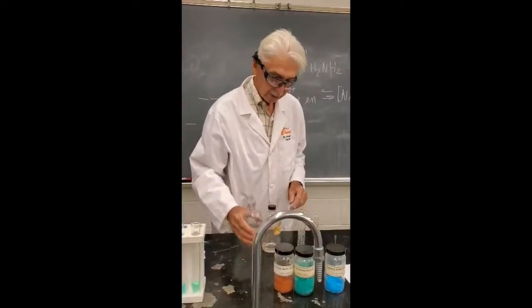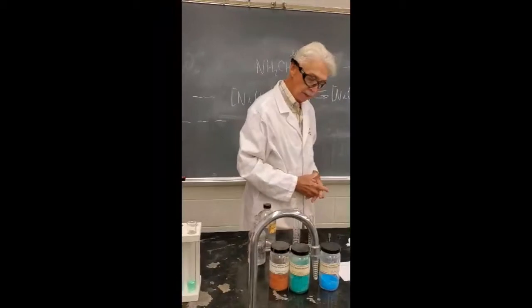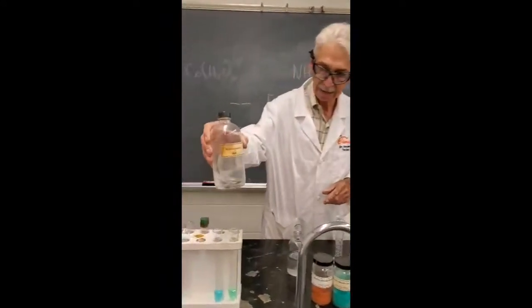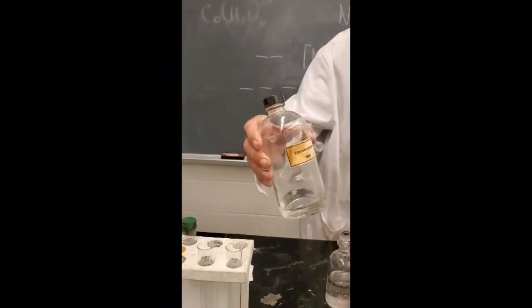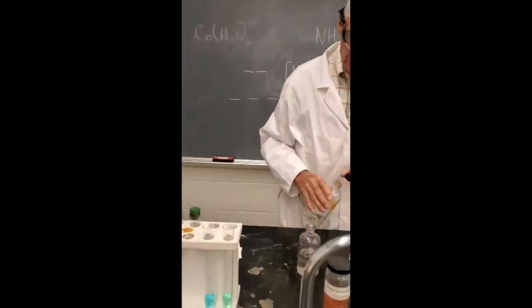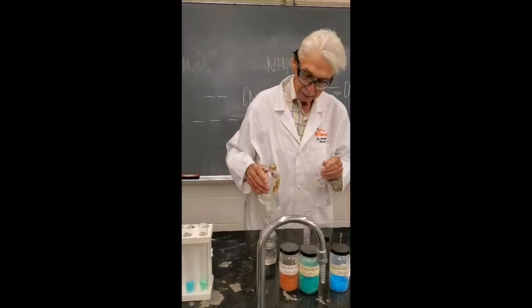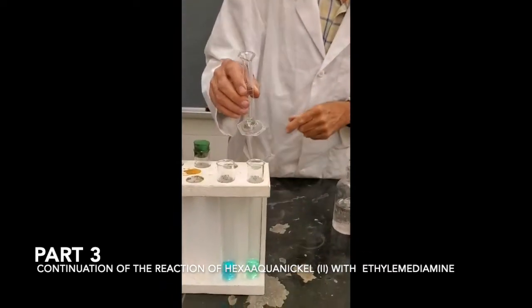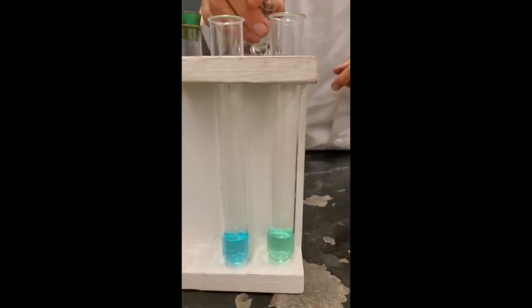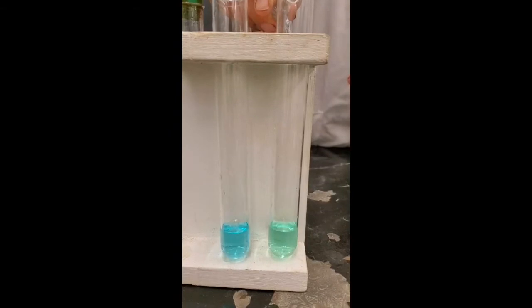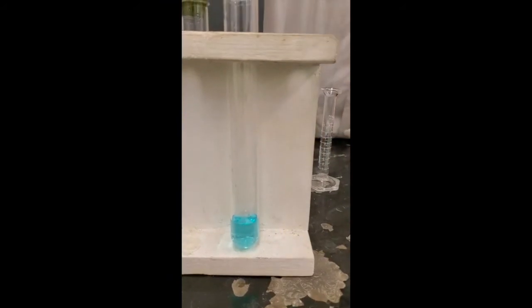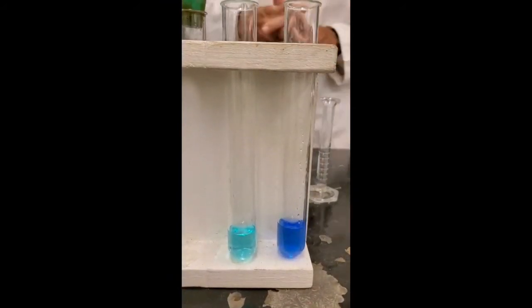So if I add, I think I've done the calculation. And if I add one milliliter of 10% ethylene, this is what the ethylene diamine looks like. It's a colorless compound. It's in solution. It's soluble in water. That's a 10% solution. And I'm going to add one milliliter to the nickel and see if you see any evidence of reaction. This is the ethylene diamine solution. And this should be enough to replace two water molecules out of each of those complexes. See if there's any evidence of reaction. Ready? See any evidence of reaction? No doubt about that, right? Isn't that pretty?